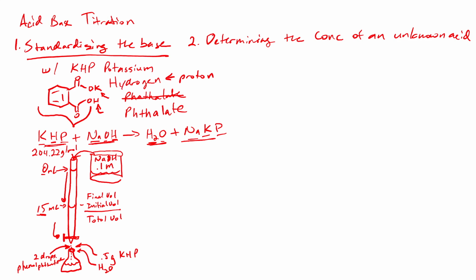And so when you have titration questions and it says something like it took 12.5 milliliters of so-and-so to get this substance to its endpoint, that's what it's talking about. Okay, so that's good. Now that you have all that figured out, you've got to figure out what the actual concentration of the sodium hydroxide is. Well, how do you do that? You've got everything you need right here.